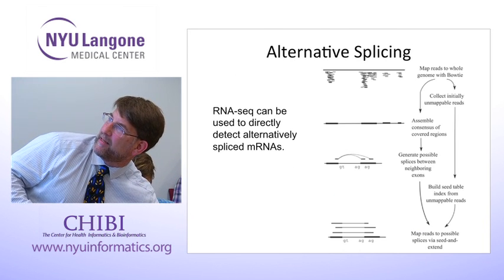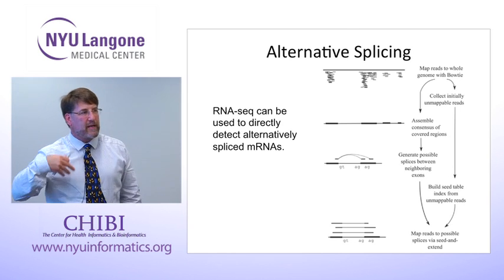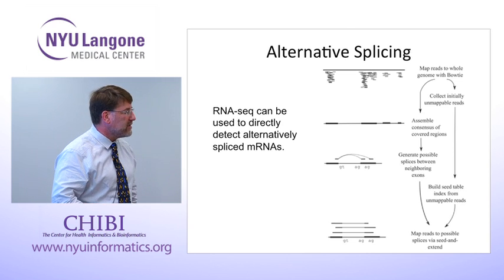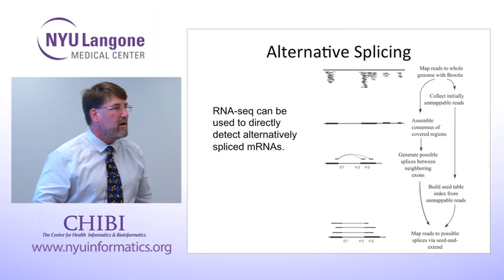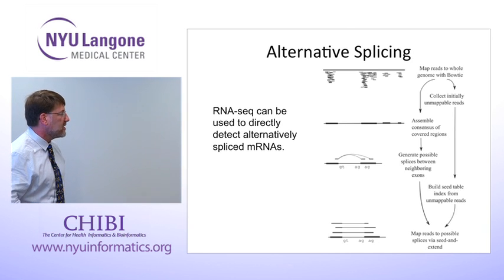All right, I'm going to skip this. Related, but not exactly the same, is this idea of finding new exons and re-annotating a genome experimentally from the RNA-seq data.